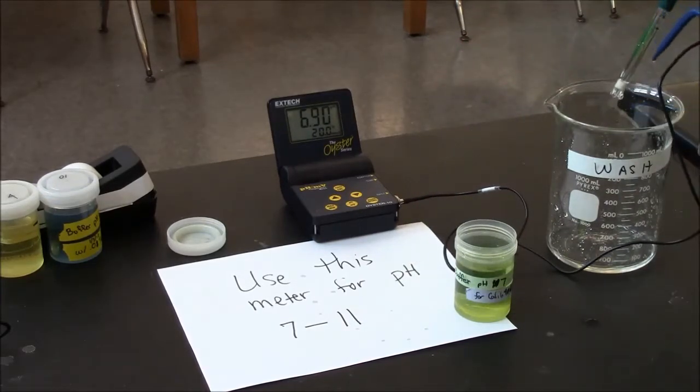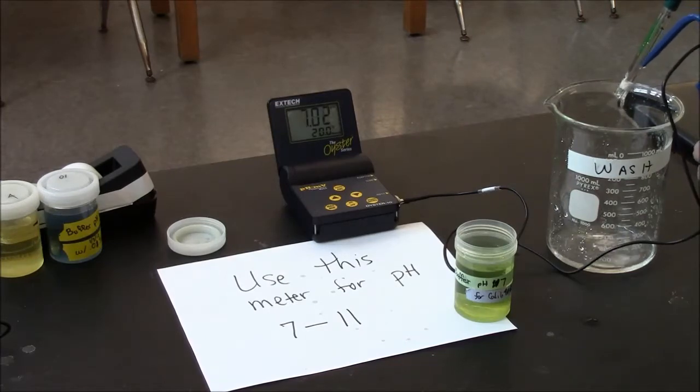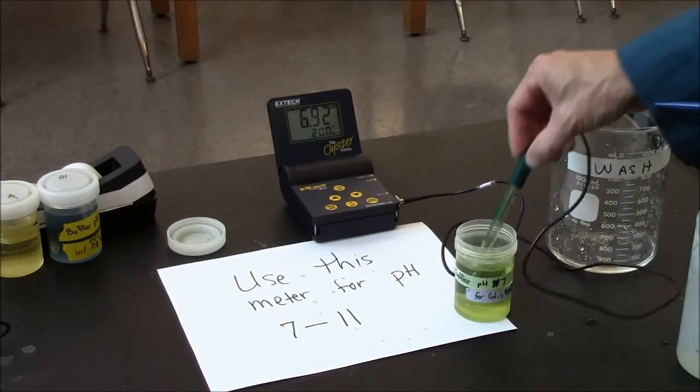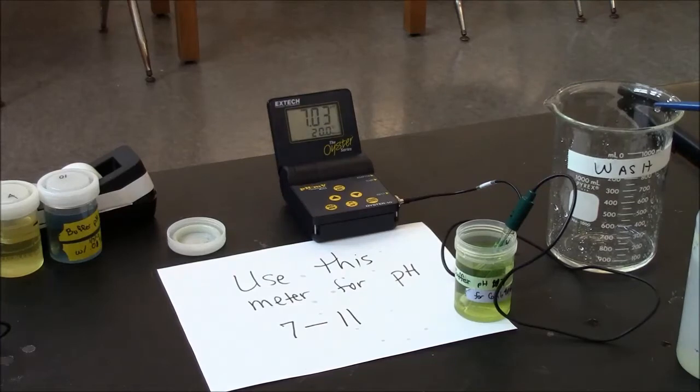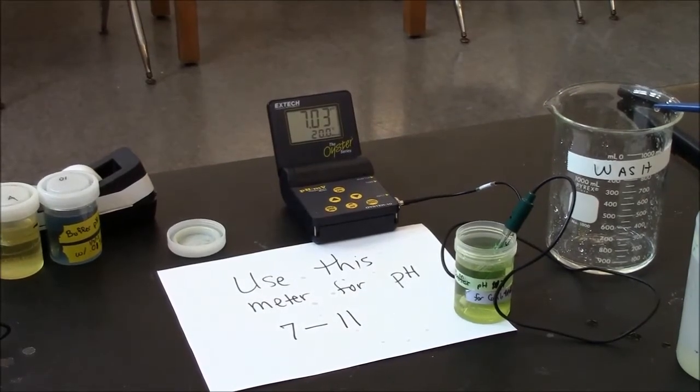Rinse off before you return it to its original buffer location. This one here should read a pH of 7.0 on the meter. The other one should read 4.0.